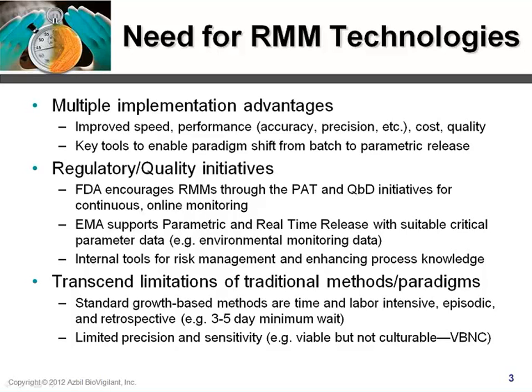The reason we want to try and reduce the operator presence is because, as is pointed out in United States Pharmacopoeia 1116, it's a recent edition, operators are the primary source of contamination in a clean room. People shed about 10 million skin particles per day, so even the best clean room garments aren't necessarily going to be able to retain all of those. So reducing the dependence on manual sample collection reduces contamination in the first place.